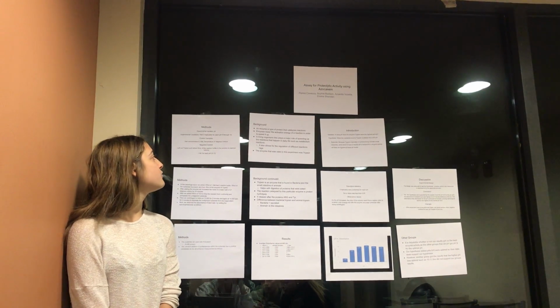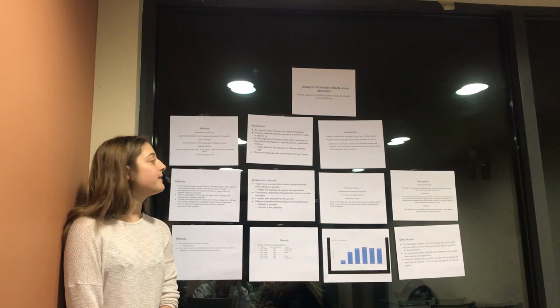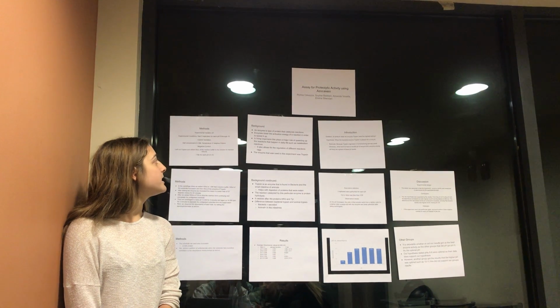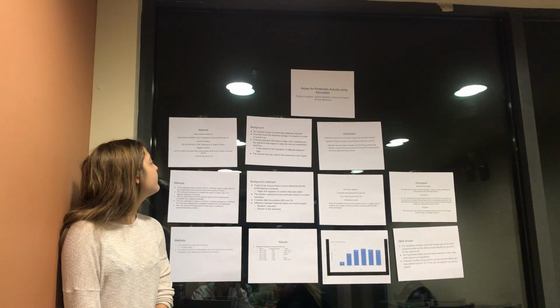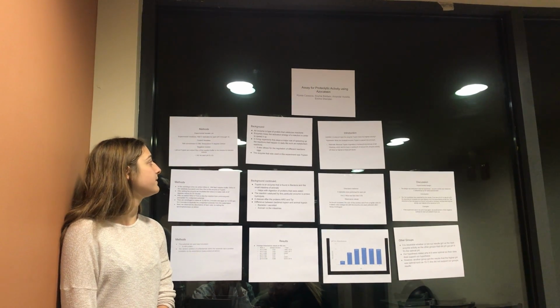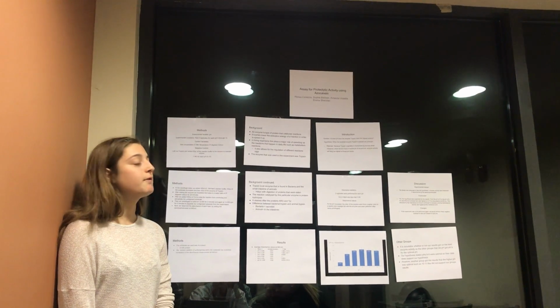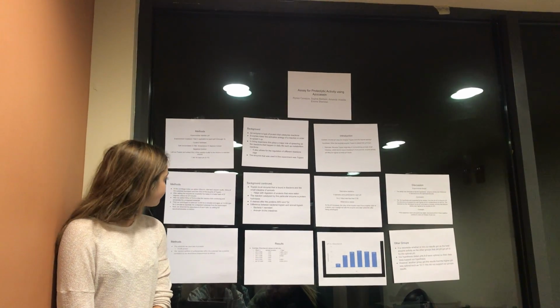and 10. The control variables were that the solution was at a salt concentration of 0.15 molar and the temperature was 37 degrees Celsius. For our negative control, we left out trypsin and added an additional 50 microliters of the reaction buffer to the solution to maintain the volume. We had 1 negative control for each pH 5 to 10.